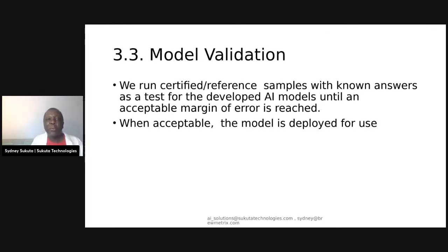And then we go through model validation. Once we build the models based on what the certified lab told us, or certified samples, sometimes we get samples in a bottle, we make sure that the model is able to predict as the certified samples say. So we run certified or reference samples with known answers as a test for the developed AI models until acceptable margins of error are reached. When acceptable, then hey, it's ready for use. It's ready to deploy.